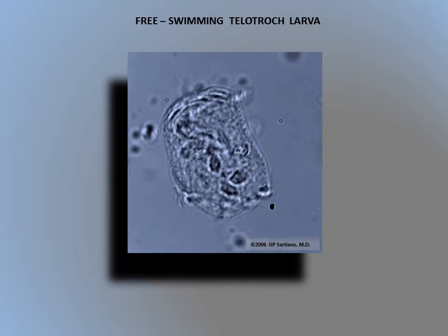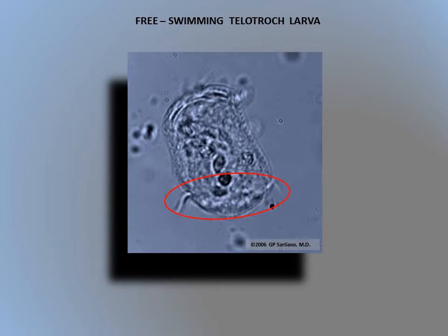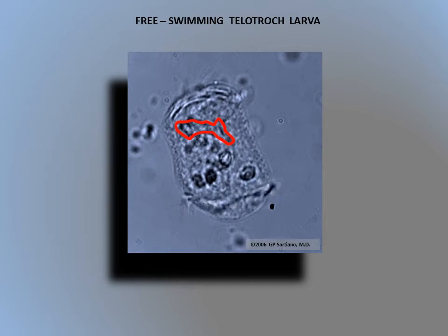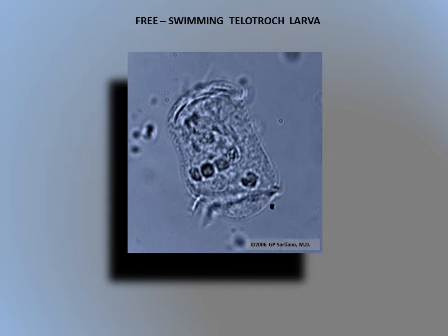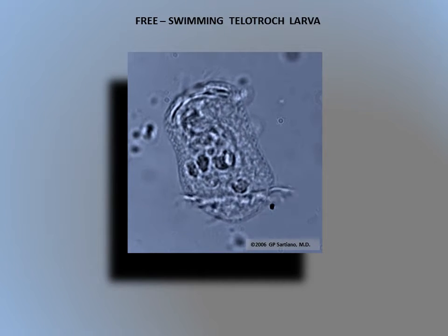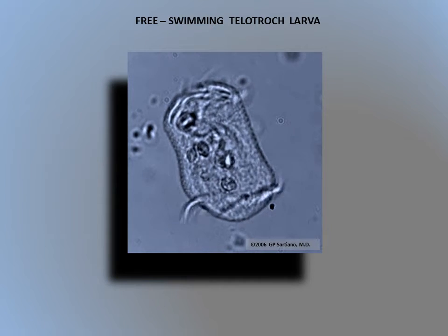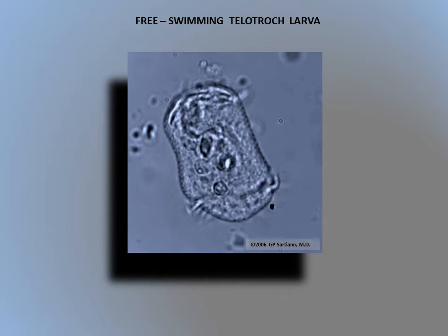This higher magnification view of a telotroch shows its coarse ciliary basal ring, its annular pellicle markings, its buccal cavity and cytostome, as well as a number of vacuoles. Note that contrary to the notion that the telotroch cytostome is closed, the cytostome periodically opens to discharge solid material.